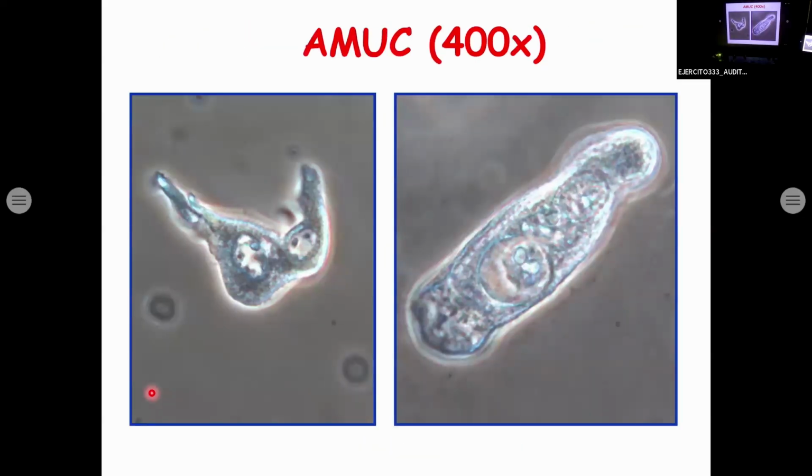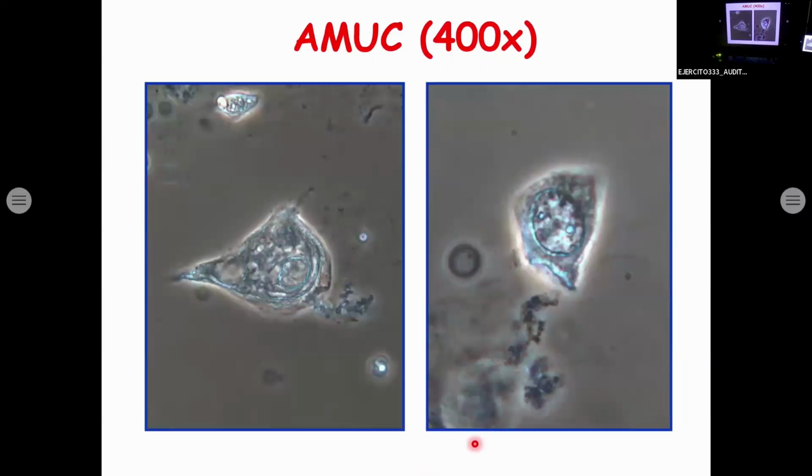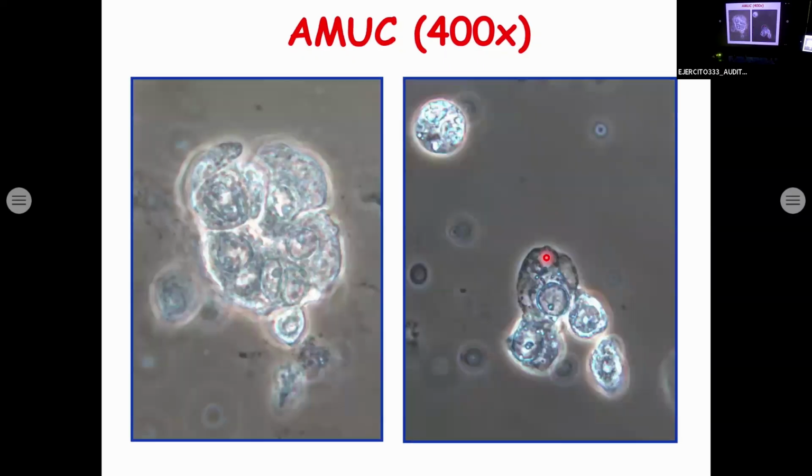And these are the atypical cells. You see two large cells with the enlarged nucleus and very evident nucleoli, a very big cylindrical cell, I would say, with at least two nuclei and very large nucleoli, another atypical cell with large nucleus and two very large nucleoli, a cluster, a clump of cells, and again a clump of atypical cells.